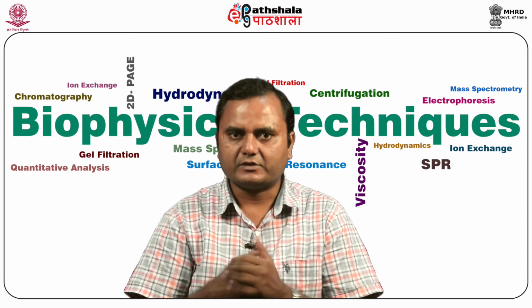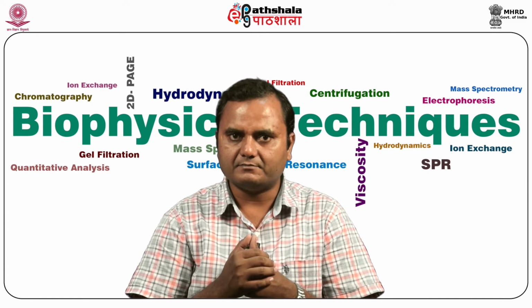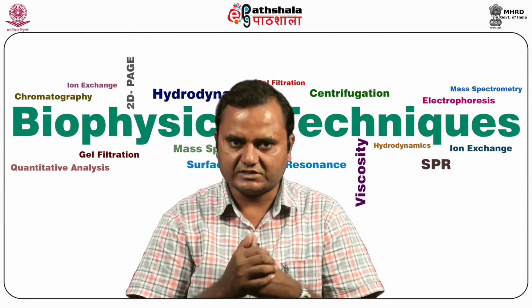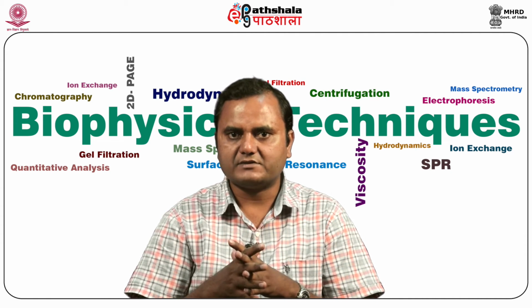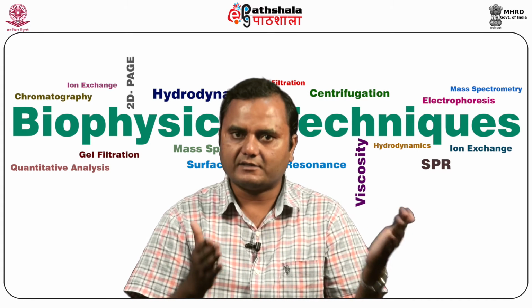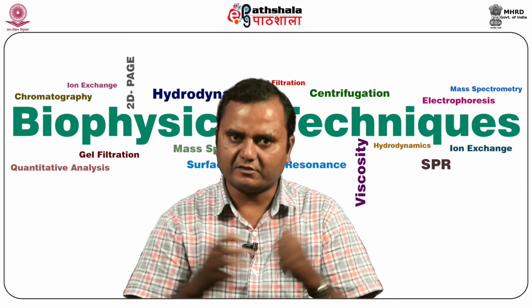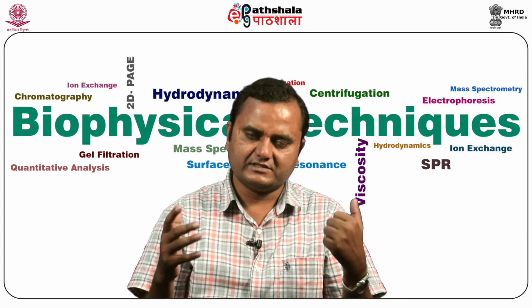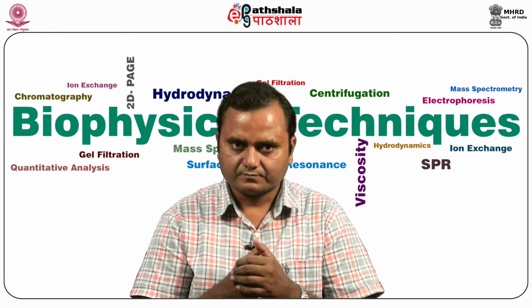Then it is used to characterize macromolecular conformational changes, then measure the equilibrium constant and thermodynamic properties of associating and dissociating systems. It is used to characterize the solution state behavior of the molecules under various conditions, and of course it is also utilized to measure the thermodynamic properties as well as the hydrodynamic properties of the molecules in solution. So this is a widely used technology. Of course it is a very costly technology, but it is widely used for various biological purposes.